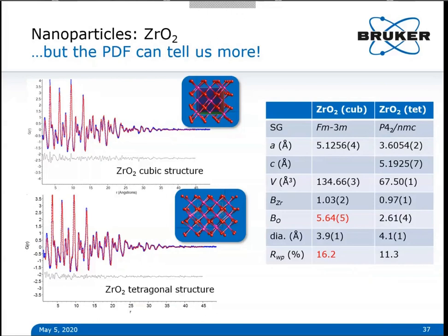Now you might have to make the capillary shorter because maybe there isn't the same amount of room, and also orient the capillary so that it's perpendicular to the beam. So it's a little bit different from a single crystal experiment. And then the background measurement was done exactly the same way, just an empty capillary measured with the exact same measurement strategy.